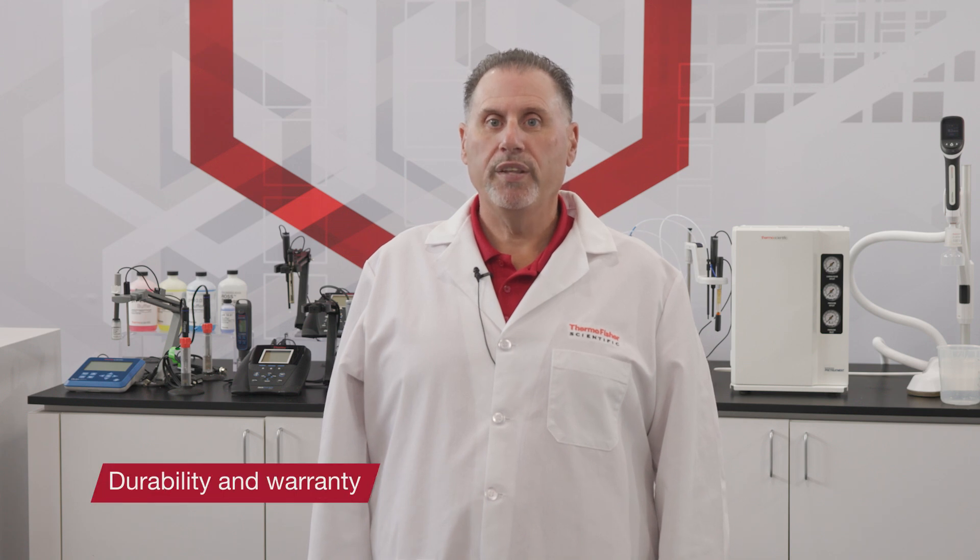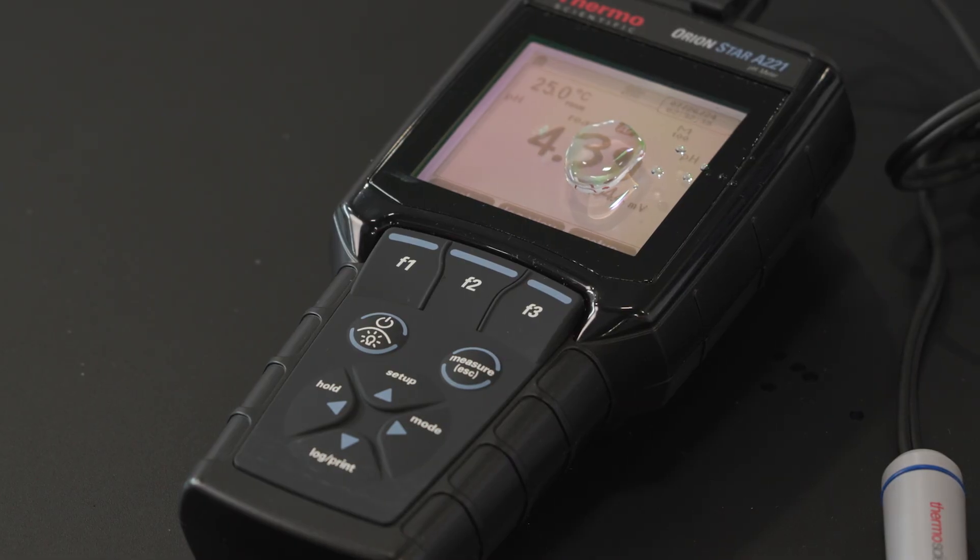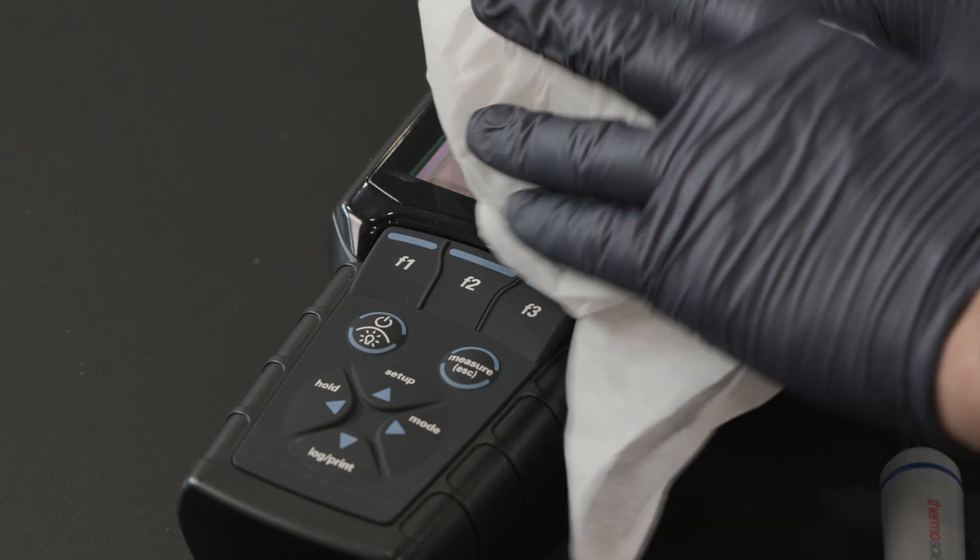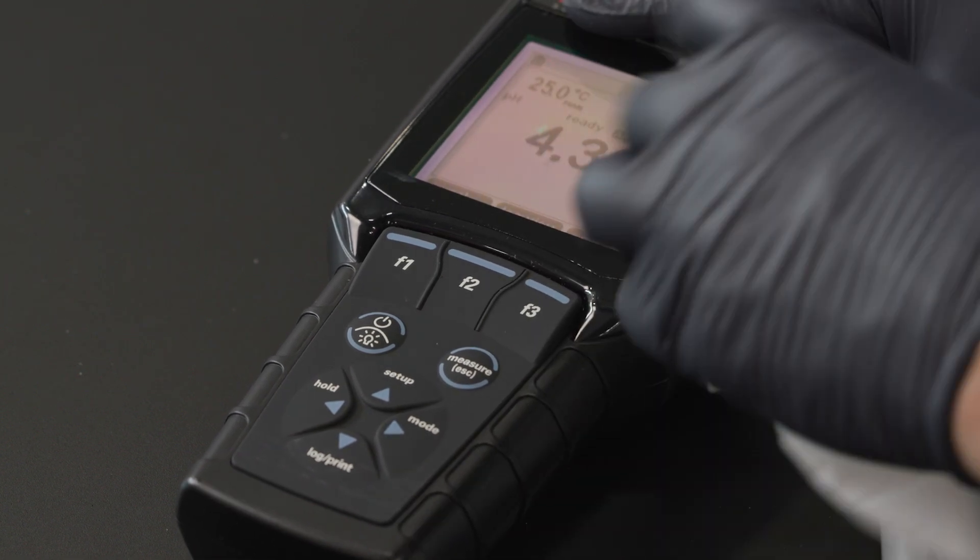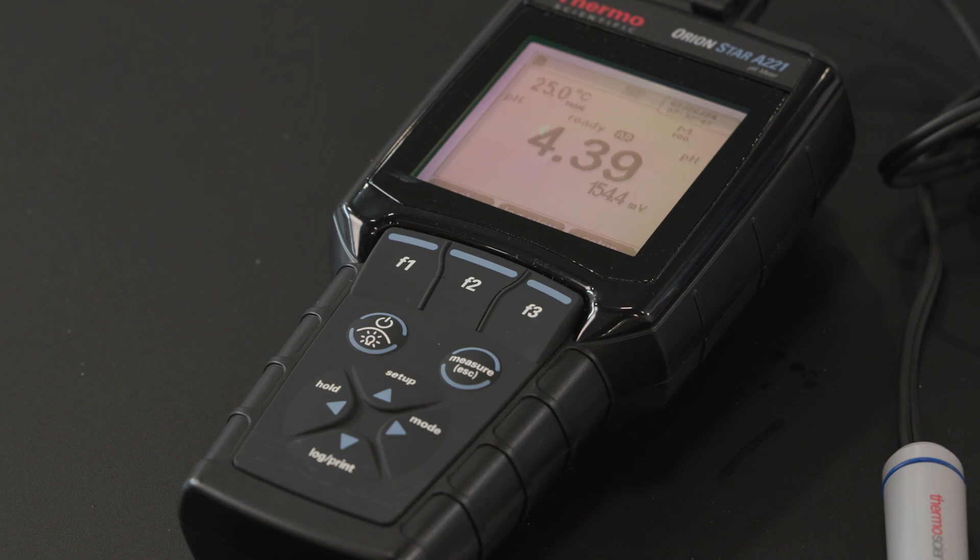Ensuring that you purchase a meter that can withstand tough testing environments is important too. Verify that the meter has an IP rating. IP67 rated products protect against splashes, dust intrusion, and limited immersion. Don't forget to evaluate the manufacturer's warranty too. Look for a minimum of a 3-year warranty to help safeguard against any manufacturer's defects.